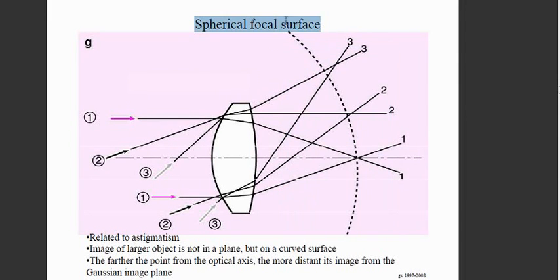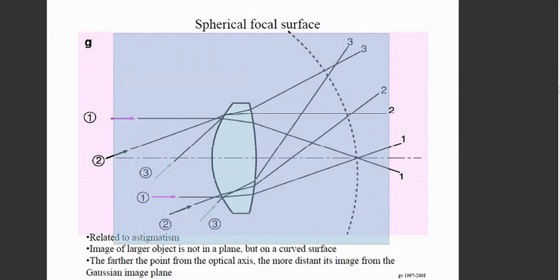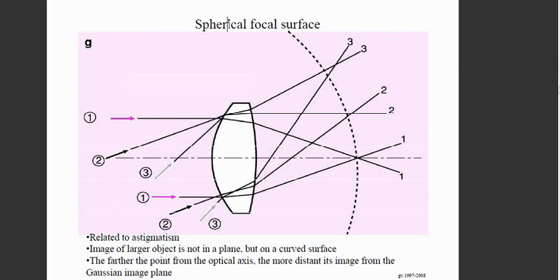I have never seen this aberration asked about, and it wasn't really explained in the presentation. What the professor said is this could occur, and that was pretty much what he said. If you're looking for material online, there's not a lot of material about this. This is basically the culmination of a few different distinct problems within the lens system. So I wouldn't focus on that, but that is just me.